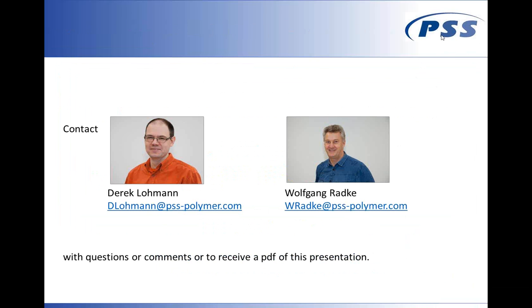One last question, I think, is when performing adsorption chromatography, and that probably is important for all people who usually do SEC and now have a first glimpse at liquid adsorption chromatography: is the pore size of the column material still of importance?